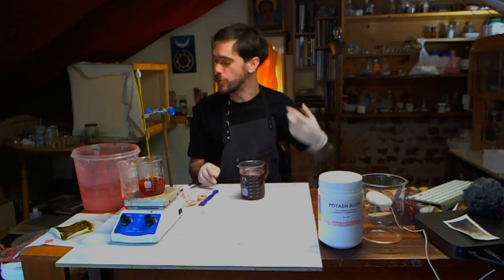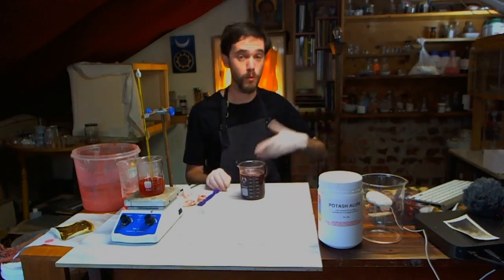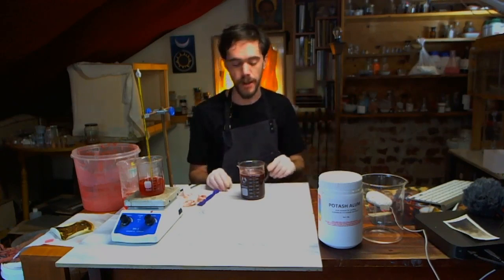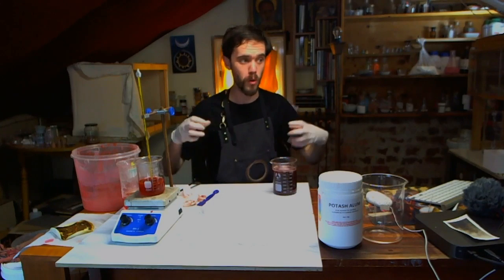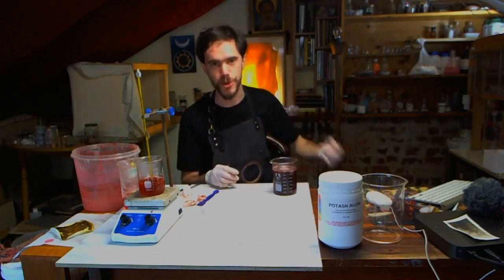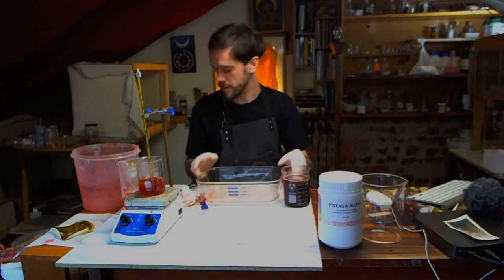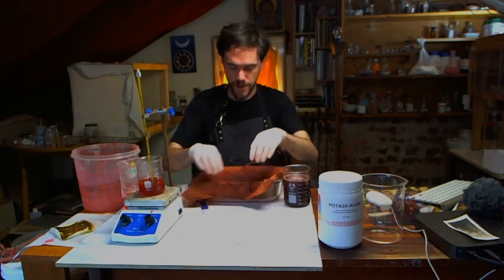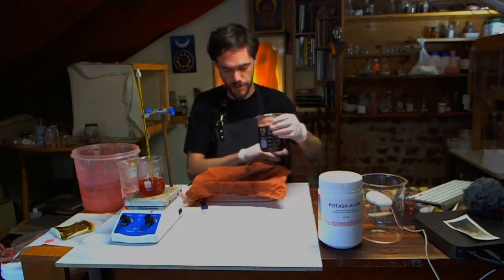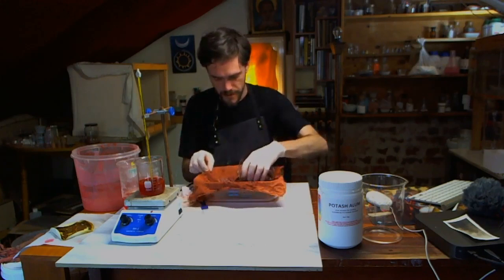Especially because you can reuse the plant material multiple times, especially if you re-soak it in acid or re-ferment it and let it sit. Then you can essentially pull more and more out of it. It gets weaker and weaker the more you do it, but there's no point wasting it if you've got it. And even if you get a lighter, duller pigment, that's not necessarily a bad thing. You can still... Alright, this should be the last wash to get rid of all of the sulfate.